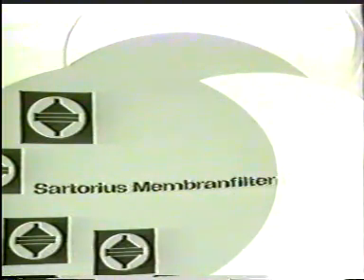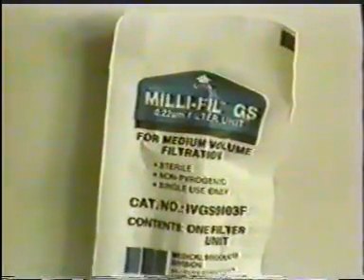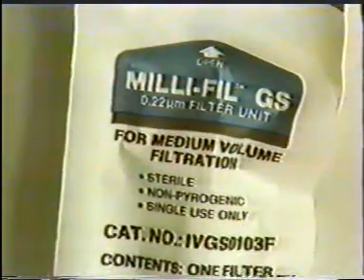Membrane filters are made from cellulose, cellulose esters, and other polymers, all of which do not shed particles. Their structure is uniform and in close-up resembles a honeycomb. These honeycomb-shaped pores interconnect and allow the passage of liquid whilst retaining particles. Different grades of filter have pore sizes varying from 12 to 0.05 microns. For sterilization, a pore size of 0.22 microns or below is necessary.